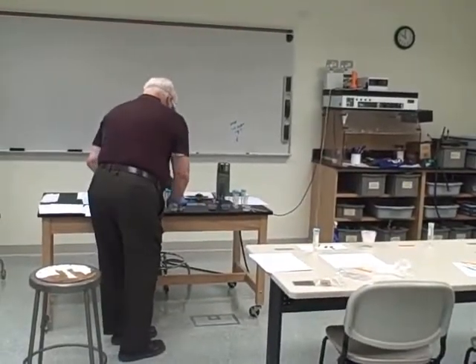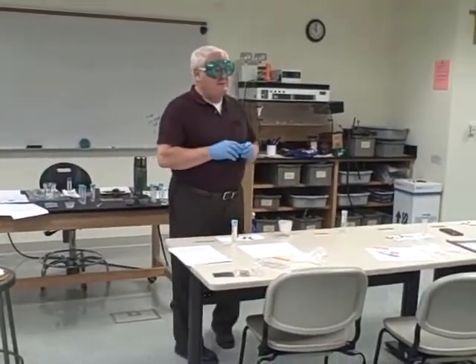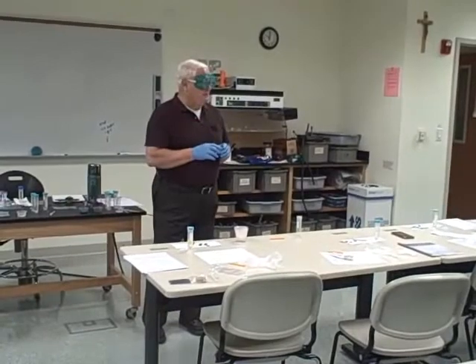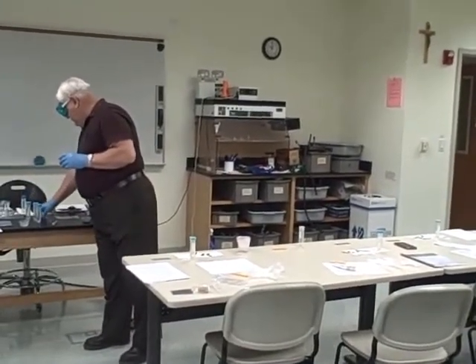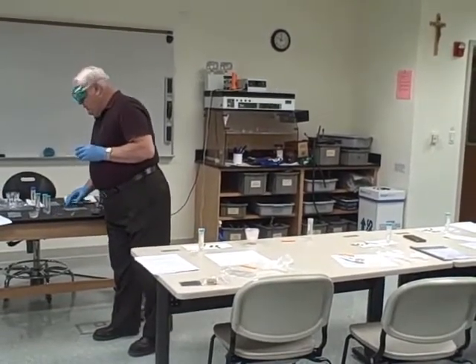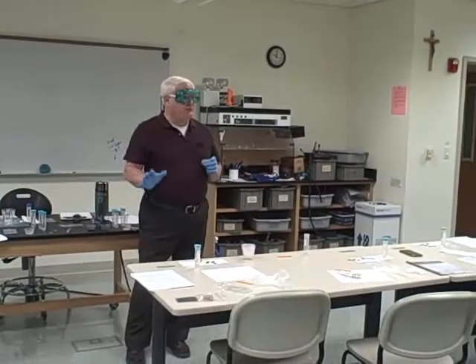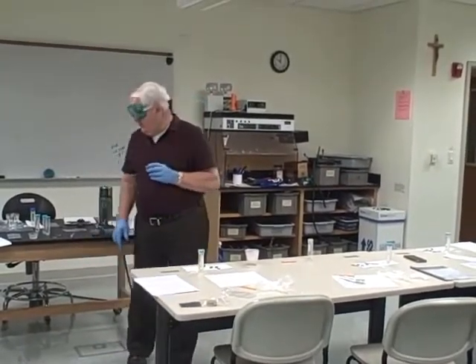Now, at the demonstrator's table, you have those same 6. That's just a demonstration. We're not going to let the kids have access to the calcium. The fumes are a little irritating, so we probably don't want to get too close to the kids. The comment was the fumes are pretty bad, so maybe stay in the center of the room at your strategic point, if you would, and let the kids see what's going on from there.